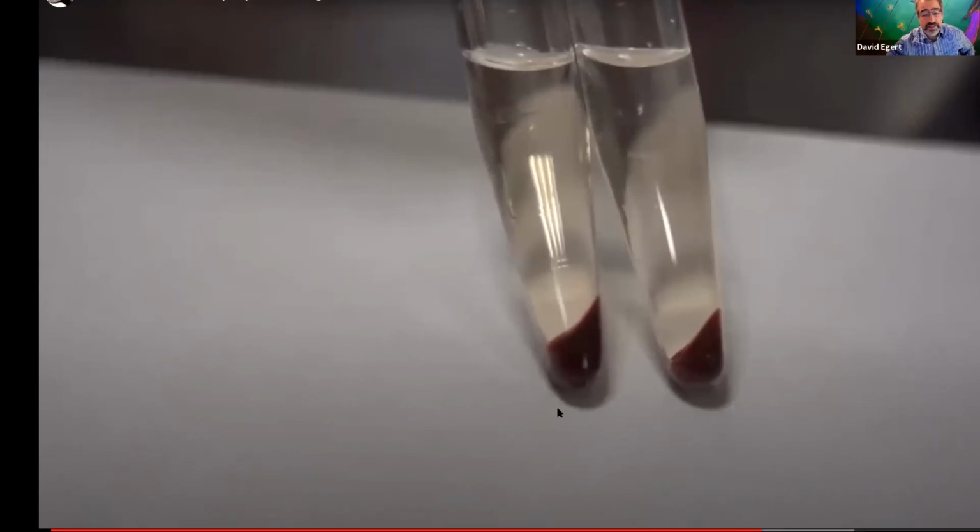Which one of these do you think has crenated cells in it? The one on the right. The one on the right, you can definitely see the pellet is smaller. This would be like the 100 raisins versus the 100 grapes. They're more shriveled up, so they compact down more. So here we actually can see, using just this kind of macroscopic view, that these are different, and this probably crenated versus this one. So just from looking at these, you actually can see this difference between the isotonic and the hypertonic saline, which is kind of cool.